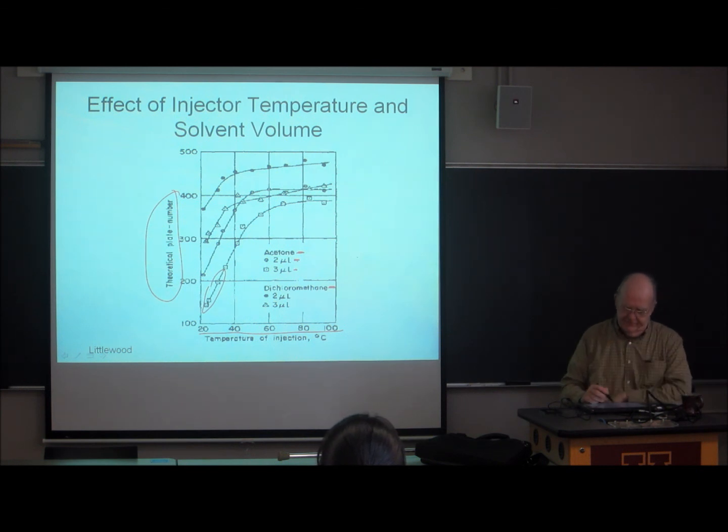As you increase the temperature, it goes up and up and up. You see, even here, you gain a little bit by even going to higher temperature. And if your samples were able to handle a higher temperature, you should raise the temperature further.